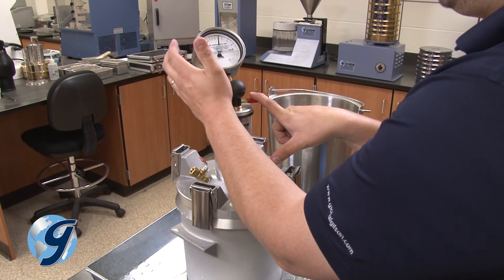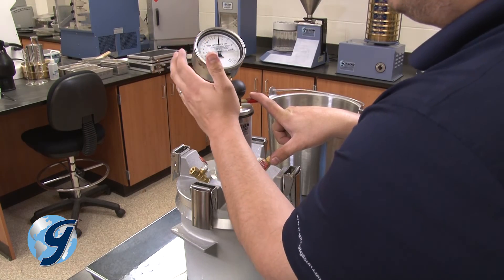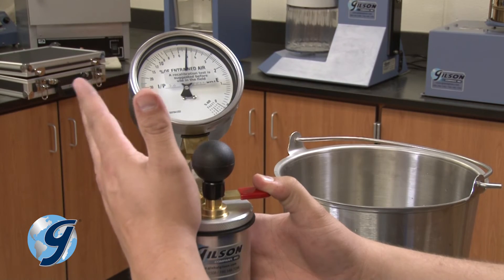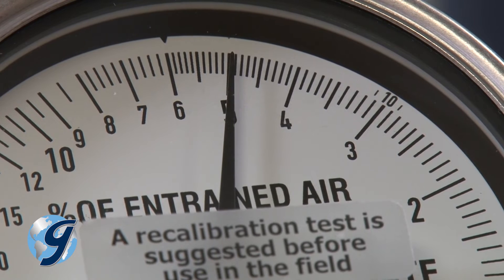The gauge should read plus or minus 0.1% from the correct air content as determined by the calibration of the calibration vessel. In this demonstration, the value is 5%.